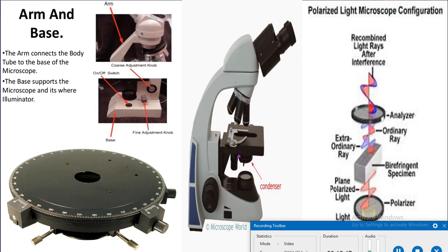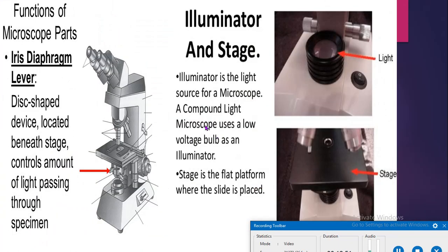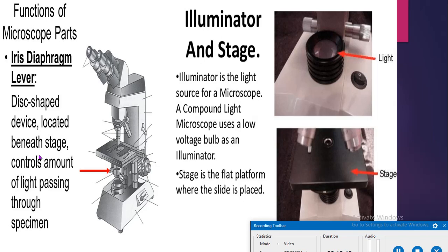The iris diaphragm is a disc-shaped device located beneath the stage that controls the amount of light passing through the specimen. It is located under the condenser and regulates the intensity of light. Its major function is to increase the natural contrast through refraction without blurring the image. A neutral grey filter is used for controlling the light intensity.